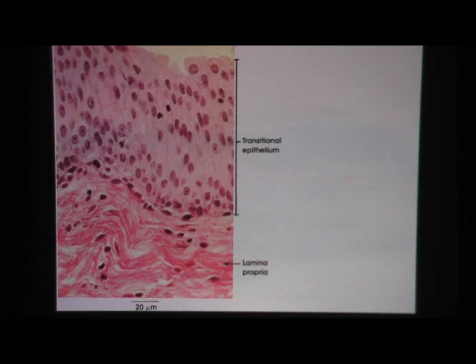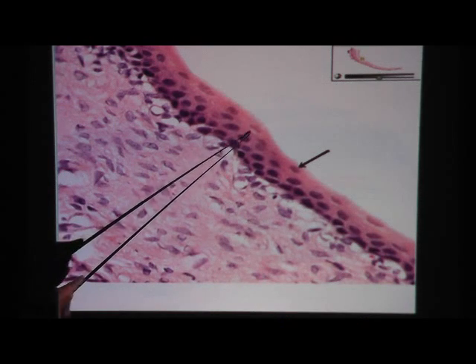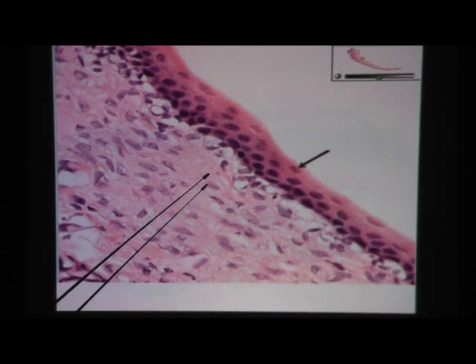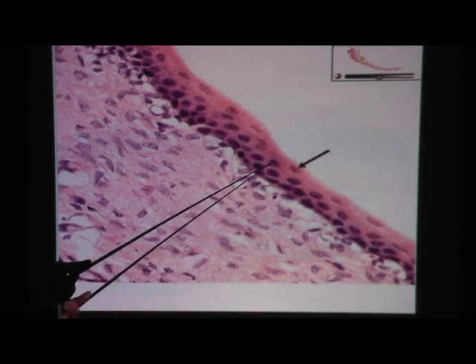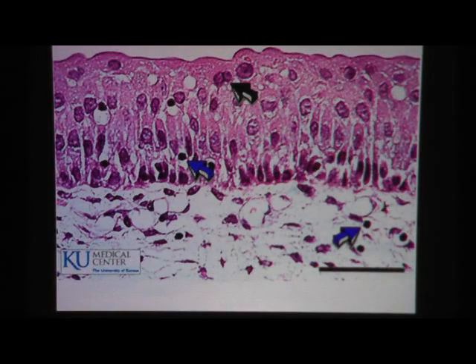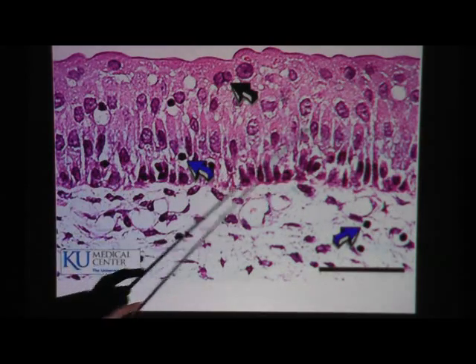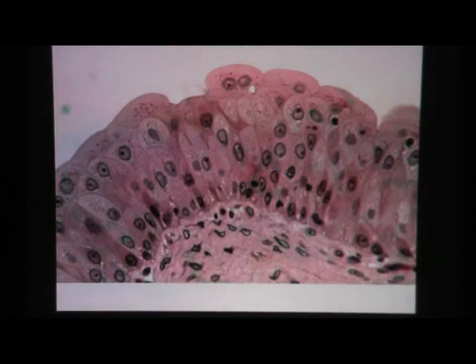Another transitional epithelium — lots of cells, many layers, but no one uniform shape. Here we're looking at transitional epithelium that is stretched, so let's say this is a stretched bladder. The thickness is not as great as the last slide because it got stretched out and is distended, but you do see pretty healthy nuclei throughout. Additional views show round healthy nuclei throughout the tissue — these cells are definitely alive and well.